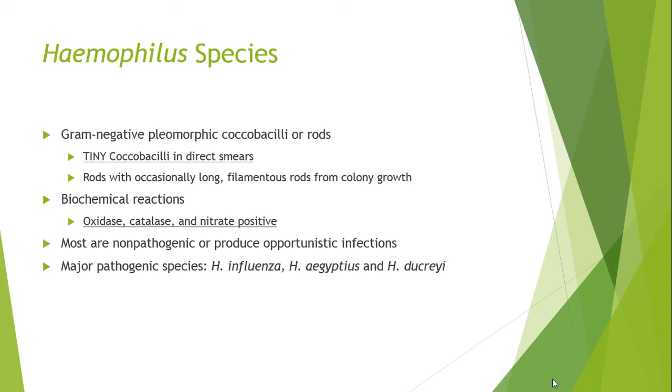You notice when we did gram stains, we had all that proteinaceous debris that was pink, and it was hard to see your gram-negative organisms through that background material at first. These guys are super hard to see. It requires some experience, and even some seasoned techs can miss it on smears.